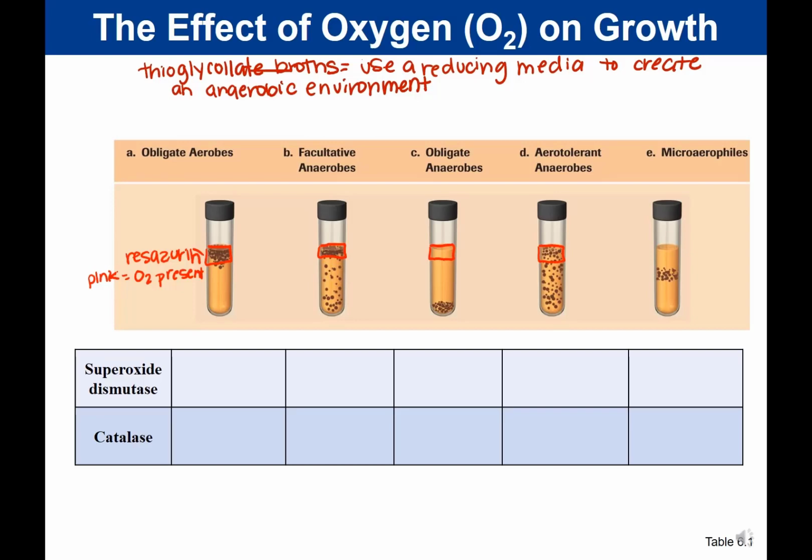And then lastly, we have our microaerophiles, and our little air lovers are going to grow right on the junction between where it's pink and it's not pink. And so in lab, we saw it growing right underneath where the pink is.